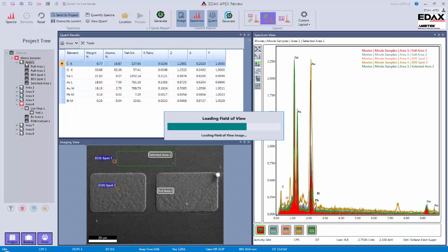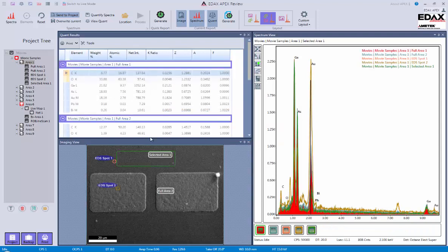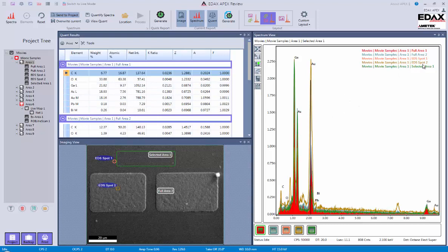So here I can see I have the area, I have my quant results, and I have all the areas listed over here.